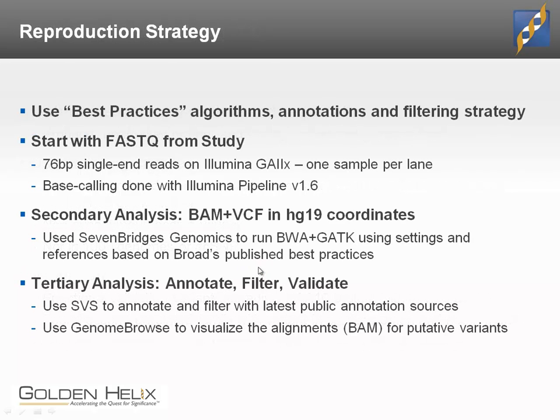So let's talk about what we could do to reproduce it using best practices today. One, we don't necessarily start from the very beginning because we can't go and get blood and resequence using, say, an Illumina HiSeq 2000. But the sequence data is coming from extremely high read depth, high quality reads here, so it's going to be a very solid starting point. But for completeness, what we're actually starting with is 76 base pair single-end reads from an Illumina GA2. They put one sample on each lane, and the base calling was done with the standard Illumina software to get to the point where we have FASTQ files.